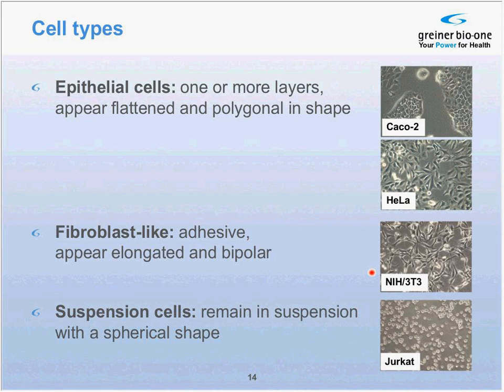Lymphoblast-like cells do not attach to the surface of the cell culture disposable. They grow mostly free-floating and do not show contact inhibition. These cells can be derived either as primary cells from tissue or tumor. Alternatively, established immortalized cell lines can grow almost indefinitely.